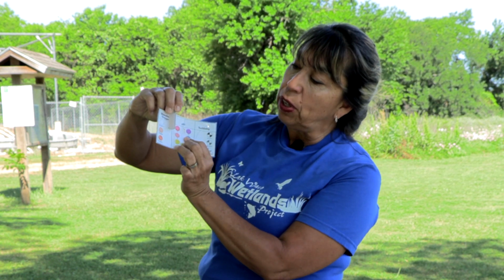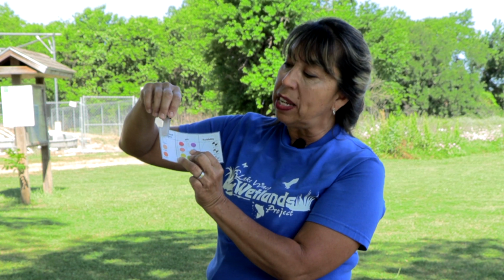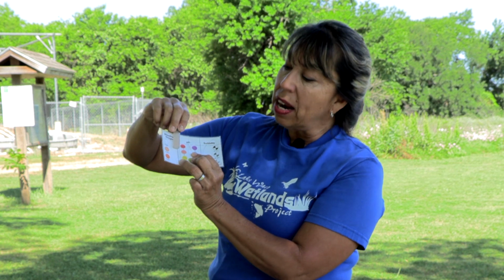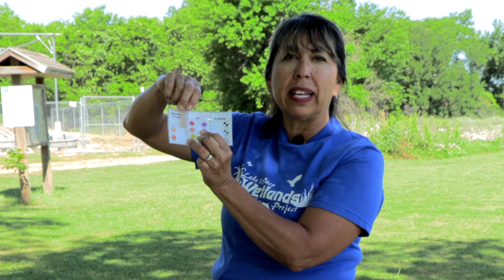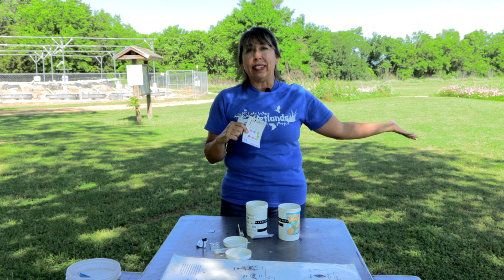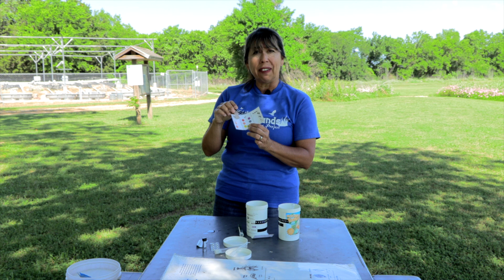So in our case, if you look at it, it's measured in parts per million. The first one is no coloring at 0 parts per million, or you have the 4 parts per million, or you have the 8 parts per million. In our case, I'm going to call it a 4 parts per million, and I think it has a little bit of coloring right in there. The good thing is it does have some dissolved oxygen in it, and I would be more concerned if it didn't, obviously, because then I would see some fish floating in the wetlands because they weren't getting enough oxygen. So that tells me that there is dissolved oxygen in there.